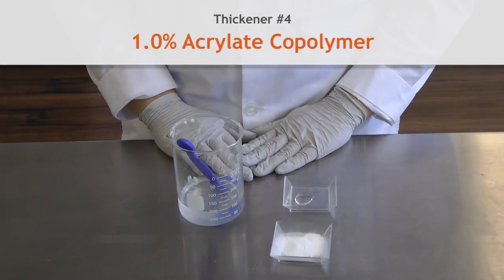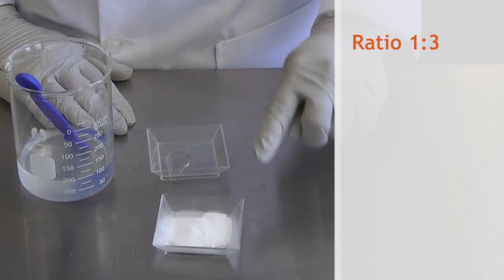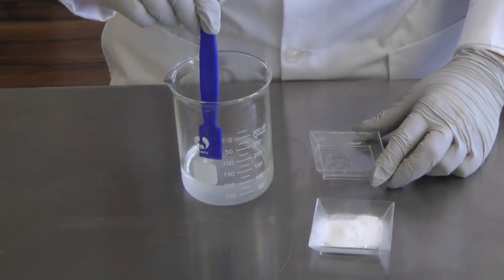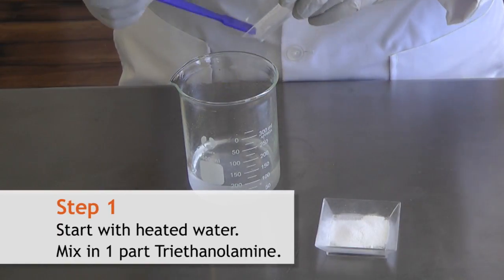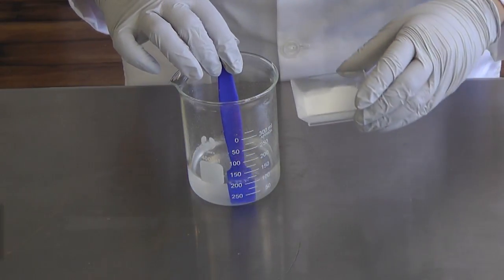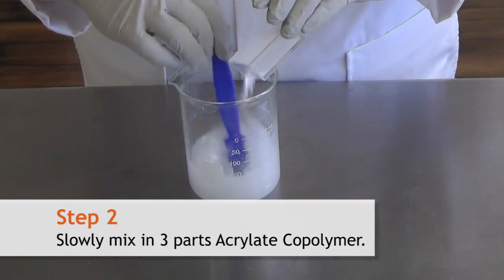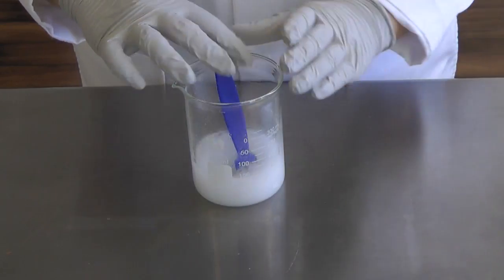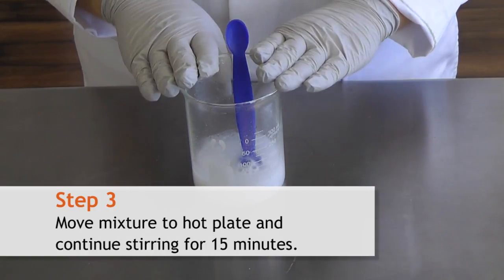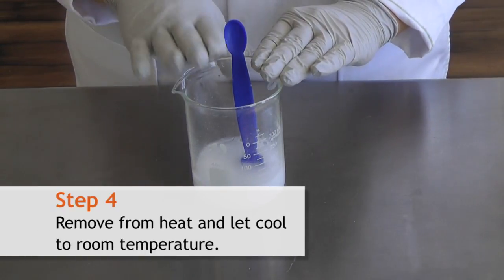The next thickener we're going to use is acrylate copolymer. The most important thing to remember when using acrylate copolymer is the amount of triethanolamine you need — a 1 to 3 ratio of triethanolamine to acrylate copolymer. Here I have heated water and I'm going to add 0.3% triethanolamine, stir, then add 1 gram of acrylate copolymer slowly while stirring to prevent clumping. I'll take this mixture back to the hot plate and continue heating for another 15 to 20 minutes with stirring to fully open up the polymer and thicken the solution. Once done heating, let it cool to room temperature and it should be a nice thick liquid.